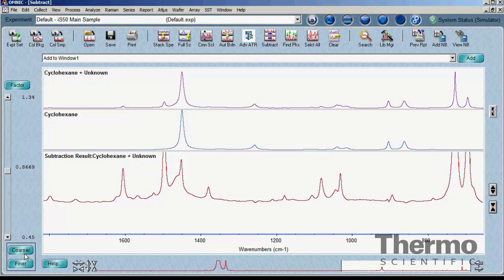Should the slider reach the lower or upper limits of its range before a good subtraction is found, use the coarse button below the slider to expand the range the factor can be changed, and then continue the adjustment. If the movement of the slider makes the adjustment too rapid to discover a correct setting, use the fine button below the slider to limit the range the factor can be changed.